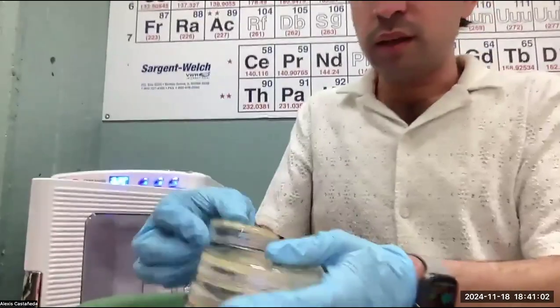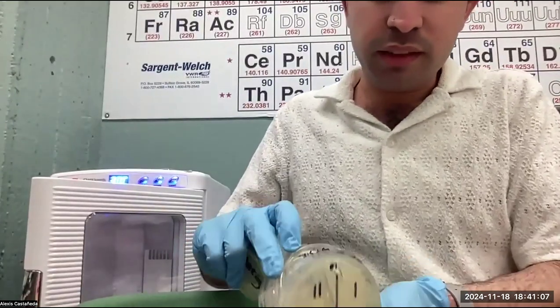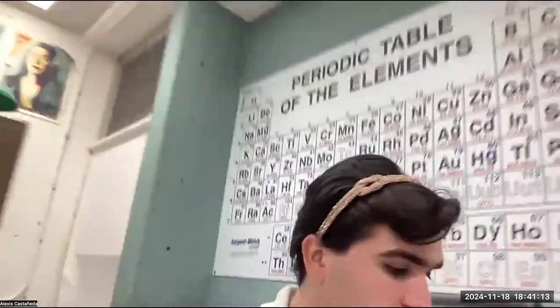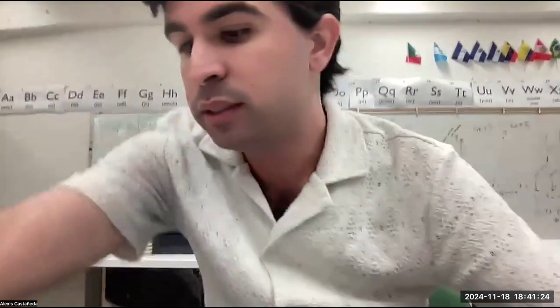So I'm pulling these out of the incubator. I have my mating plate, and then I have my 4 plates with the different kinds of antibiotics on them. So I'm going to bring these over here to my table so I can work and look at them. So let's see if our predictions were correct. We have to analyze our results now and see if we were correct.